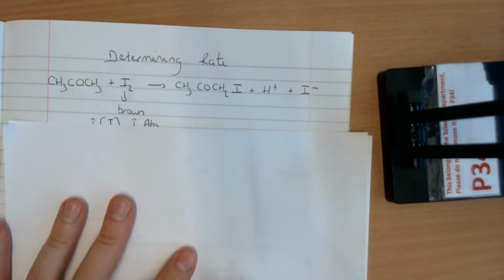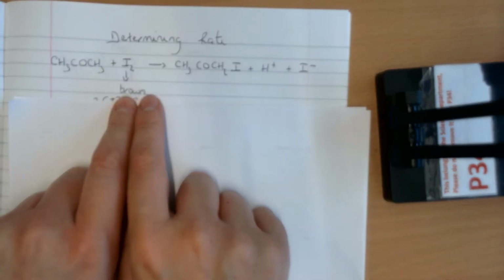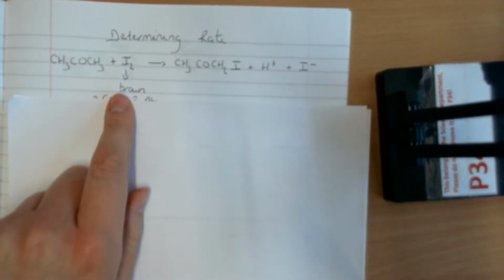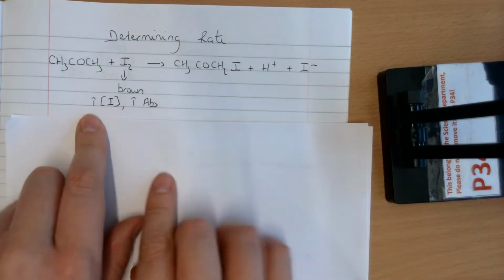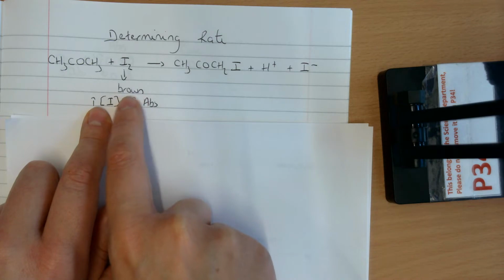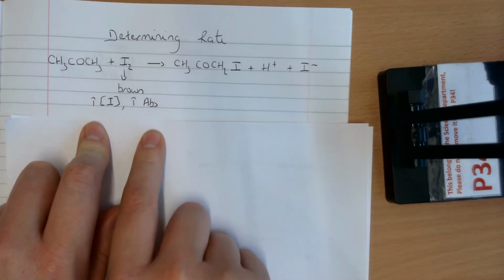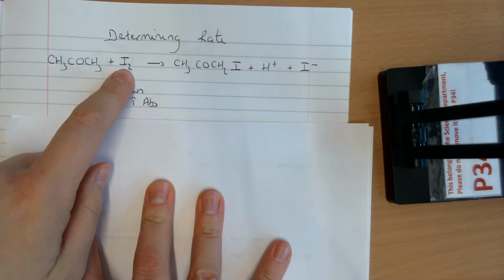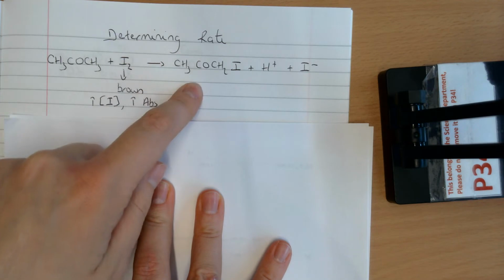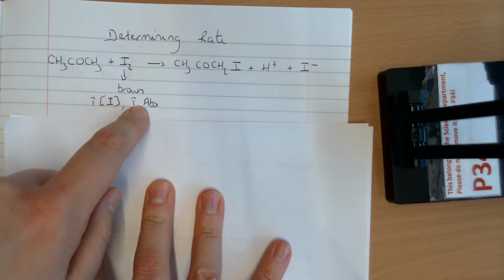Back at my question, iodine is a brown colour, so I use a special filter that enables the iodine to absorb the light, and the higher the concentration of the iodine, the more brown the iodine, the more light it will be able to absorb. And what we'd expect to see is over the course of the reaction, as the concentration of iodine decreases, as it's used up, the colour of the iodine will fade, and as the colour fades, so too will the absorbance.